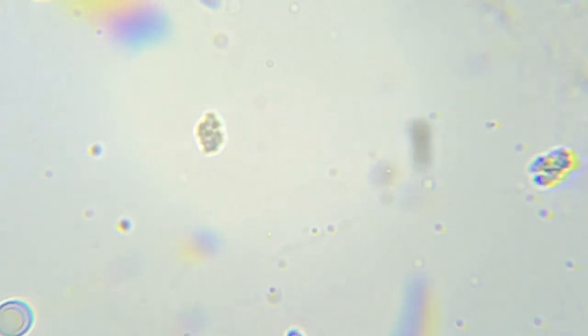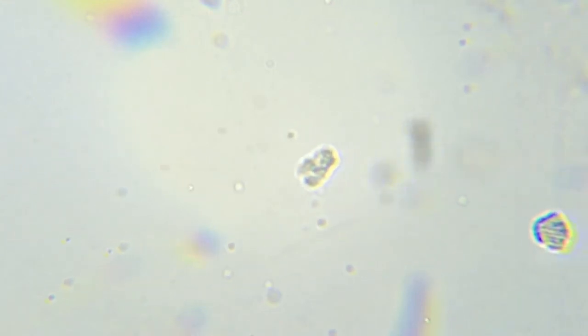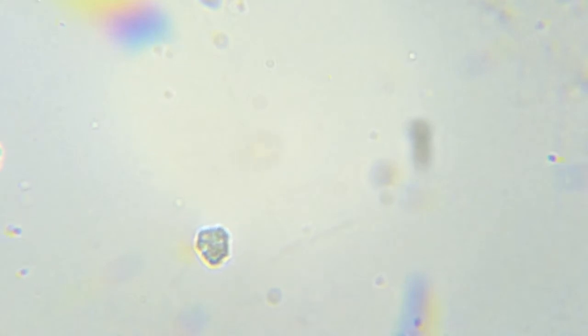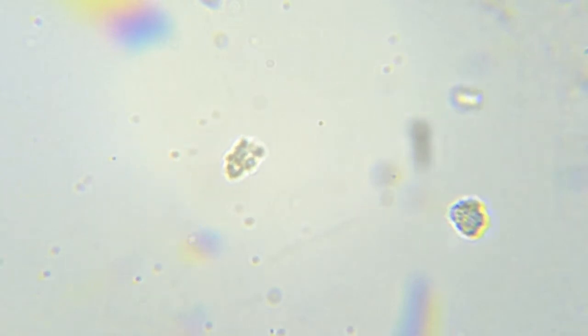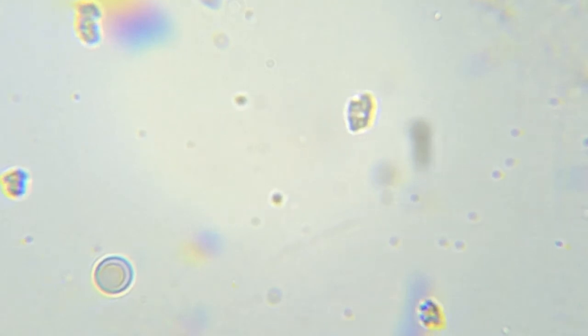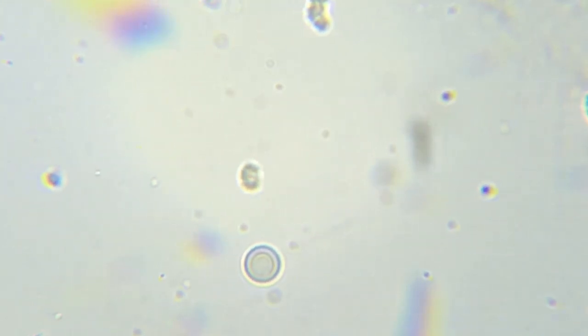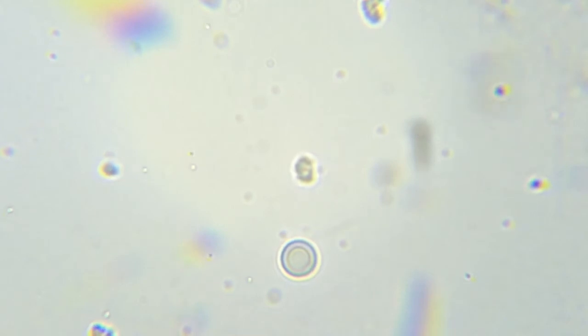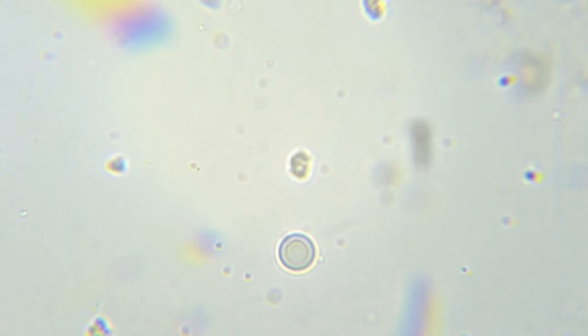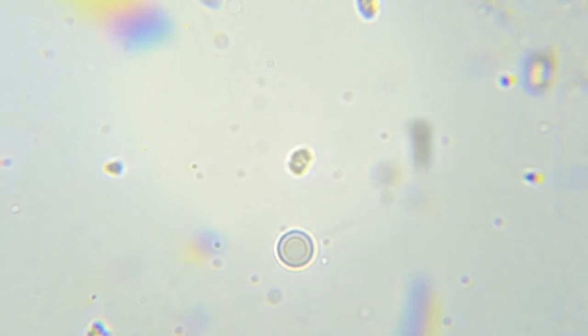These bigger clusters that you're seeing going through the middle field are almost certainly unsonicated samples of 1-micron beads clustered. I'm going to turn back. I'm going to flip the leads, see if I can go in the opposite direction now. You can see they're undergoing random Brownian motion. So there's one of those large beads there that looks like a red blood cell, and that's just refraction taking place at the edges of it.